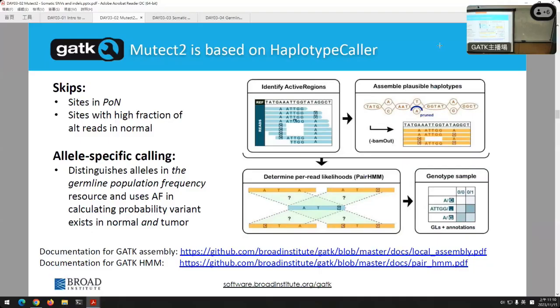If there are two overlapping reads that might disagree on what it is there, well, we toss them both. Again, we're aggressive in tossing information there because, like Eric mentioned, even the act of storing the cells sometimes has a tendency to degrade the DNA. So we want to be really sure, we have a high threshold for calling anything on that side. And the flip side of that is when we're trying to assemble potential haplotypes from the normal cells, we're actually pretty permissive, and maybe more permissive than normal.